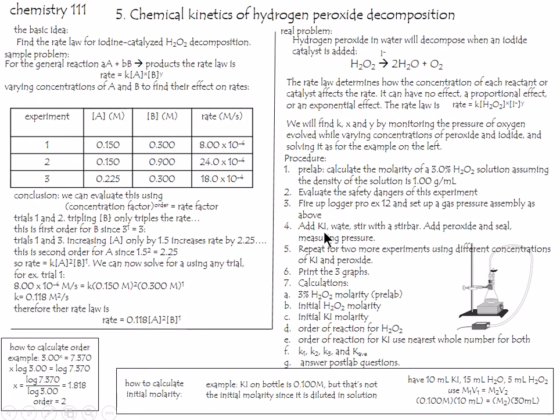Add the potassium iodide solution, that should say water, and stir it up with a stir bar. It's not sealed yet. Now when you're ready to go, you add that peroxide, the reaction begins, so immediately seal it up and measure the pressure as described in the Logger Pro part of the experiment, which I never provide in detail, just do what it says.